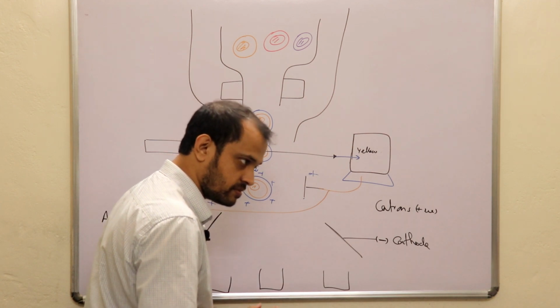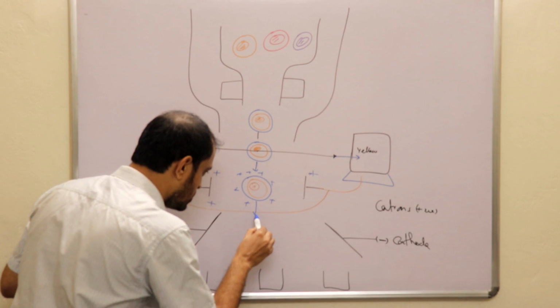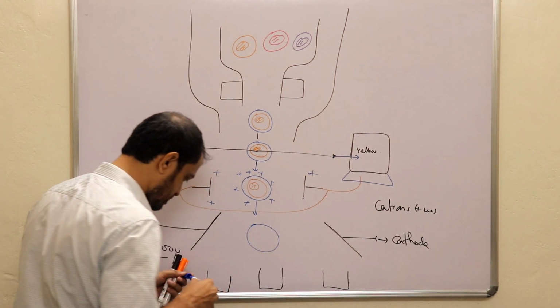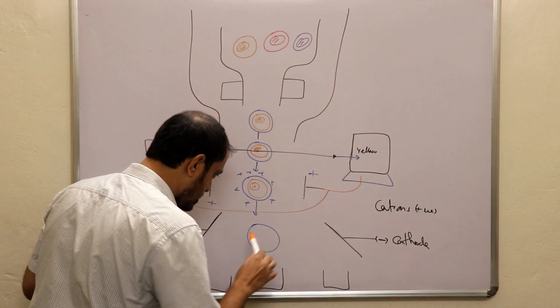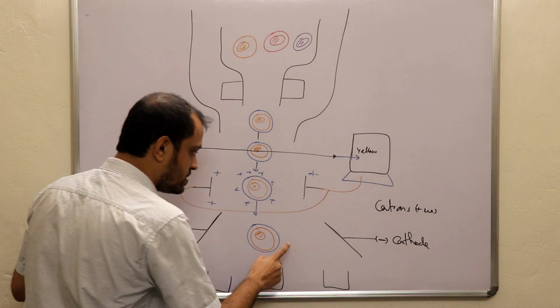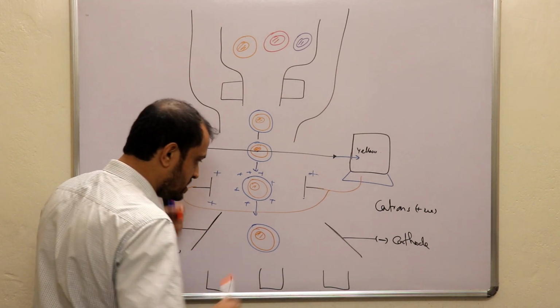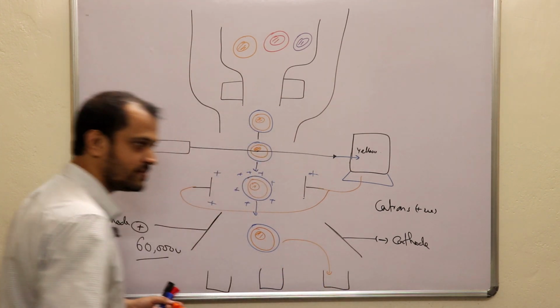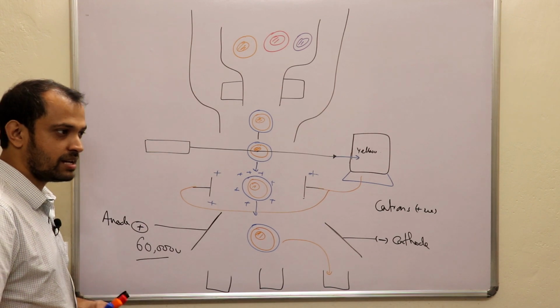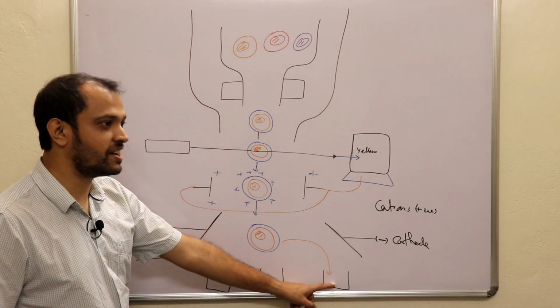Now listen with all your attention. So when this particular droplet is coming here, it will be pulled towards this plate, right? That means it will come here. That means yellow cells, in any case, whenever yellow cells fall down, will always be collected here.